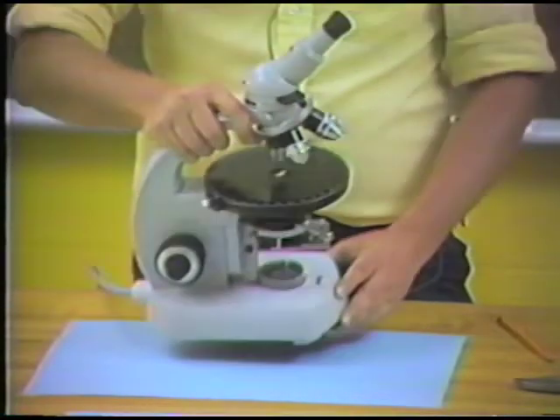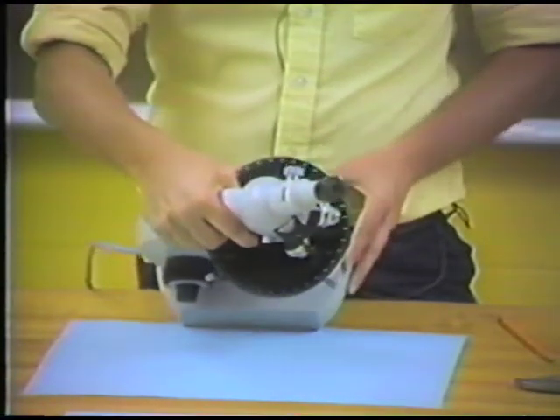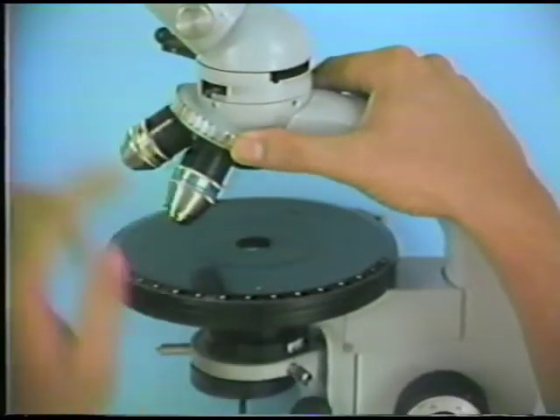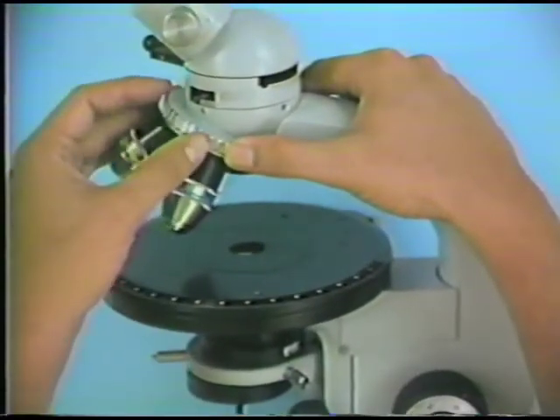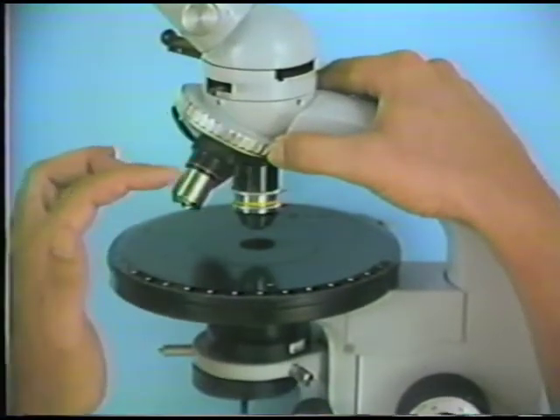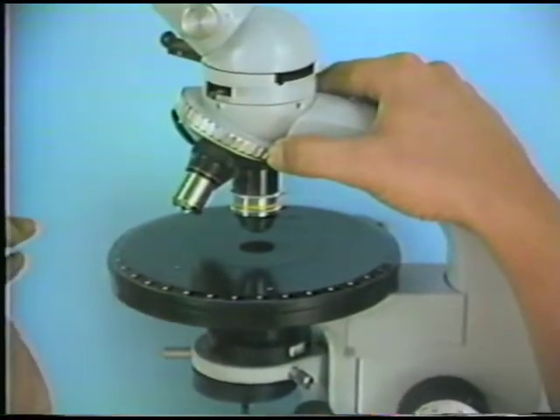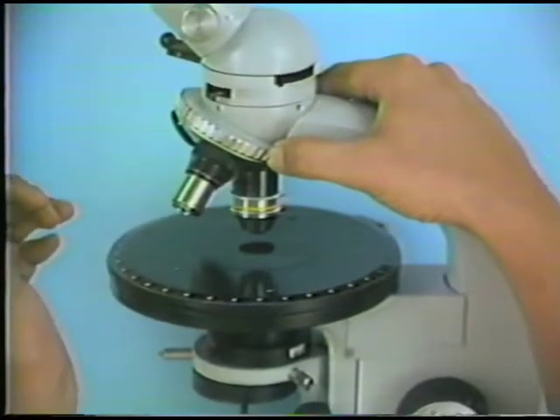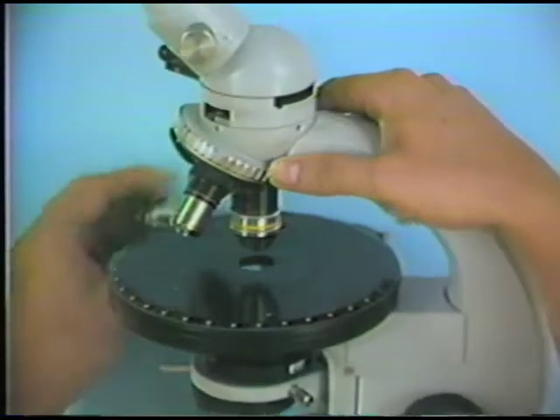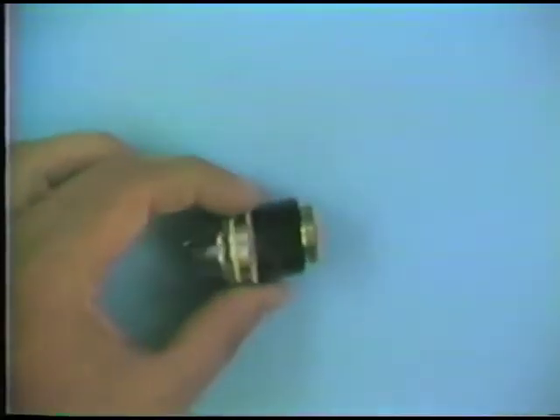These objectives have different degrees of magnification. There's a high power objective, a medium power objective, and a low power objective that are traditional in petrographic microscopes.